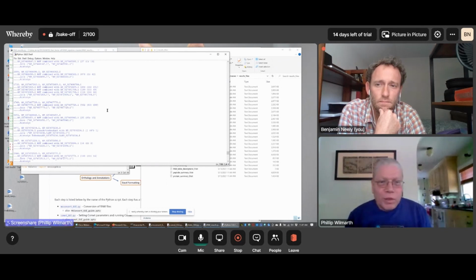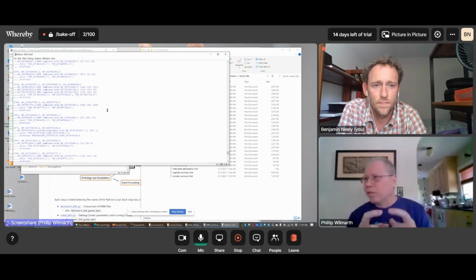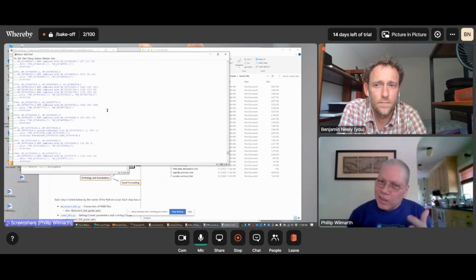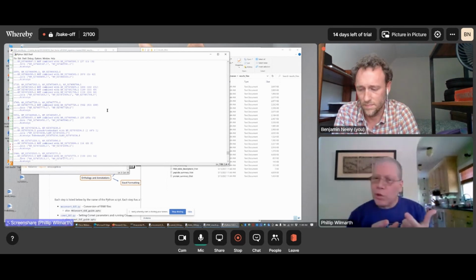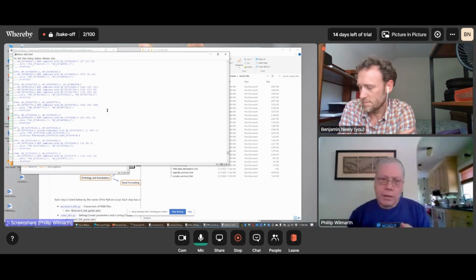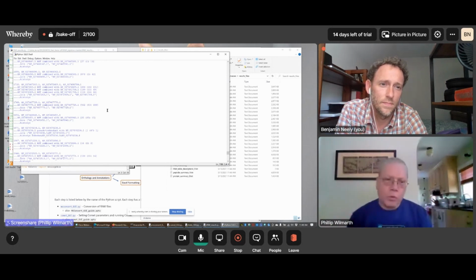So what this extended parsimony grouping does is look at whether we have just a little bit more than identical. So if 2 sets of peptides are almost identical, only having 1 or 2 extra peptides in each, but they have a lot of shared peptides, they'll get lumped together. And if we've got something that is almost a perfect subset of another protein, where only 1 or maybe 2 peptides can distinguish it, but the amount of shared peptides is large enough to outweigh it, it gets removed as a subset. And then there's also a case where we've got a little bit of extra evidence, but the amount of shared evidence is really overwhelming, so it groups those together as well.